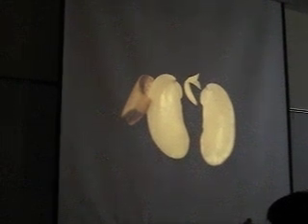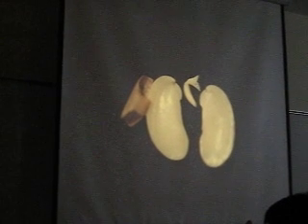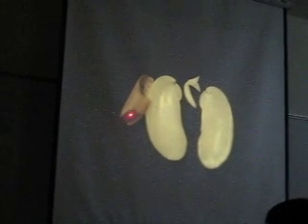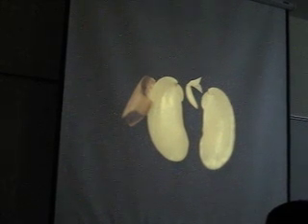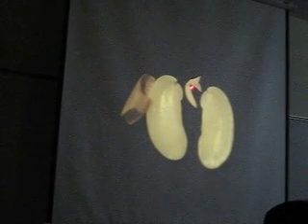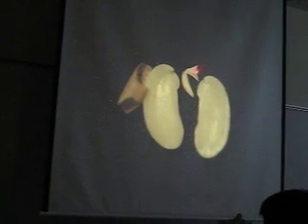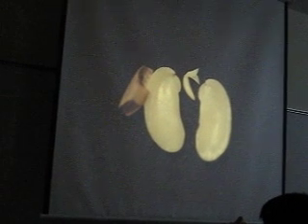Let's finish these slides. There's only a couple left. You open one up. Oh yeah, what are the parts? I mean, you don't need a microscope for this. Seed coat, cotyledon, cotyledon. Beans are dicots. Plumule, hypocotyl, radicle. Radicle, hypocotyl, plumule, cotyledon, seed coat. The 5 things you gotta know.